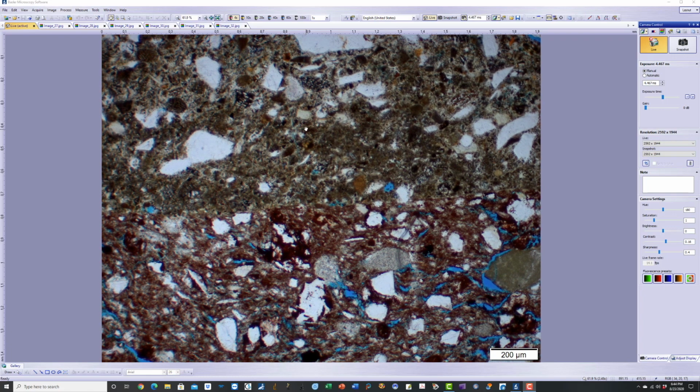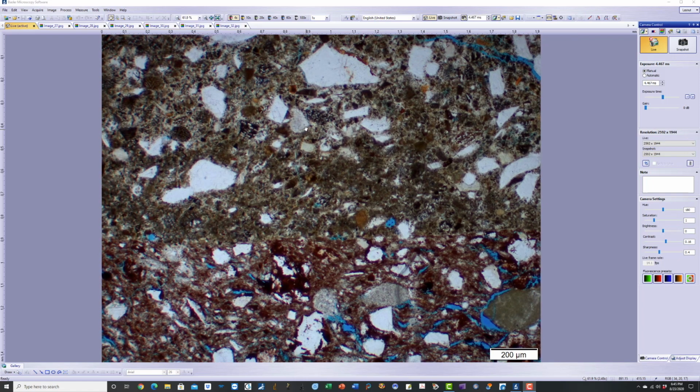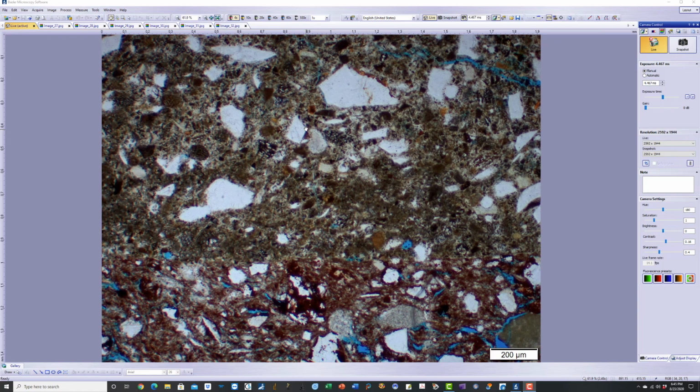The refractory mortar is a calcium aluminate based mortar, which is very typical of chimney environments or any high temperature refractory environment where calcium aluminate cement is used. And you have a quartz sand and calcium aluminate cement based mortar here.